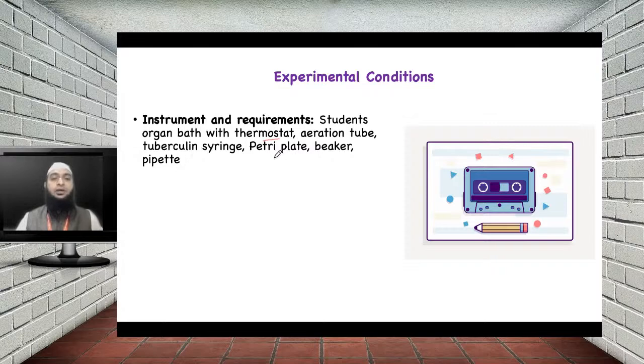Petri plate, beaker and pipette are also needed for proper isolation and for storing and taking the standard amount of the drug, that is 5-hydroxytryptamine, the standard as well as the test. So this is about the instrument and the requirement of the experiment.